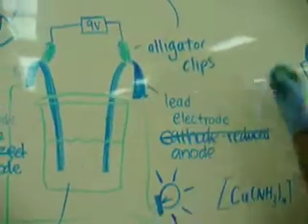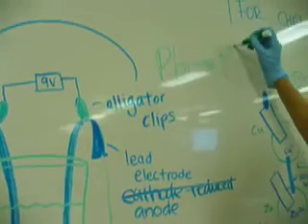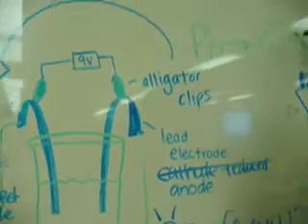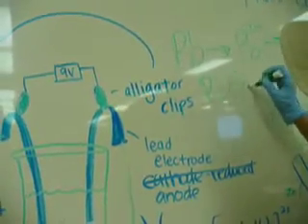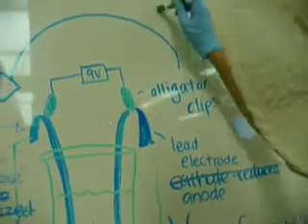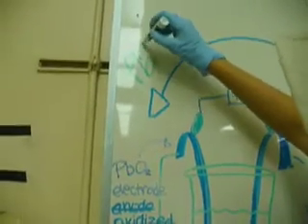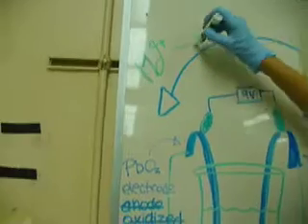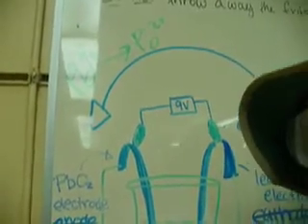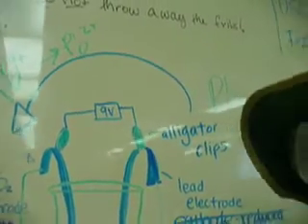So the lead here loses electrons and is oxidized and turns into lead 2+, which reacts with the sulfate ions in solution to form lead sulfate. And the electrons that are busted out over here go onto this side and are taken into lead 4+ in the lead oxide to form lead 2+, which also interacts with the sulfate ions in the solution here to form the same lead sulfate.